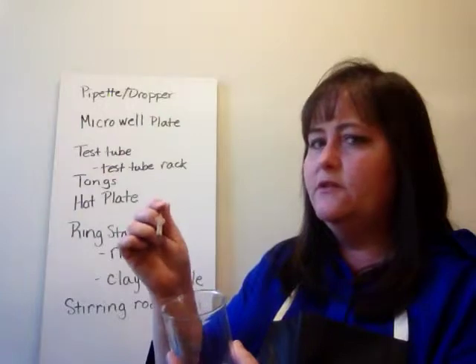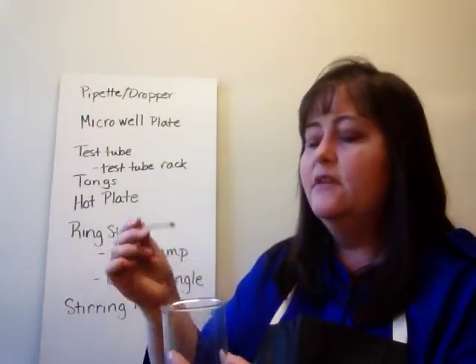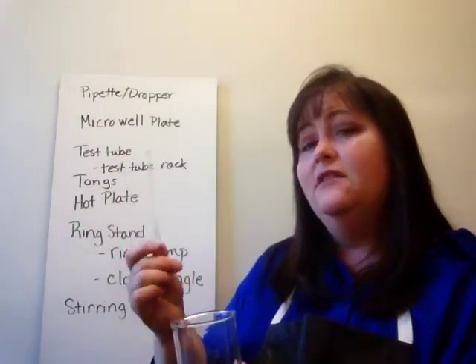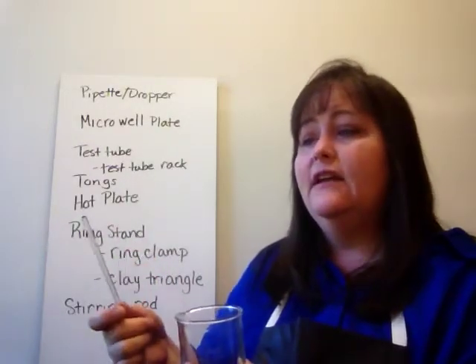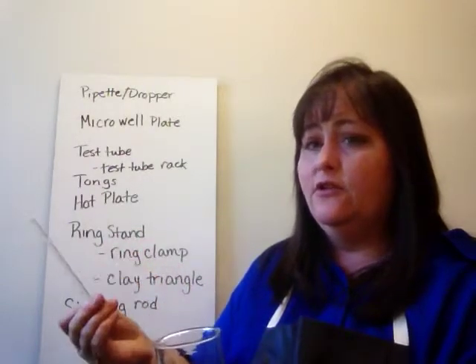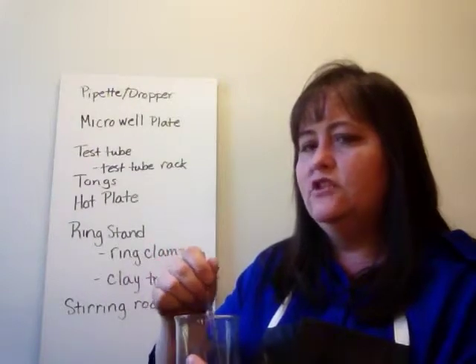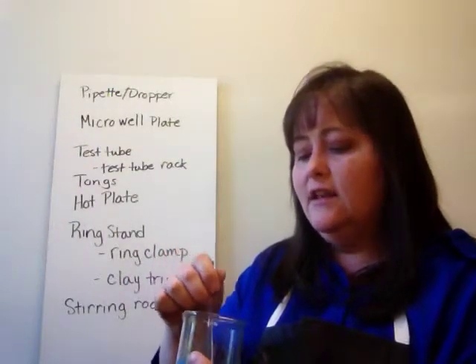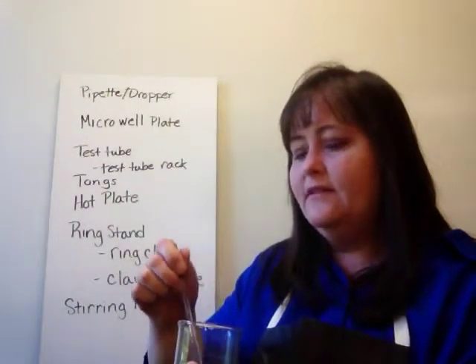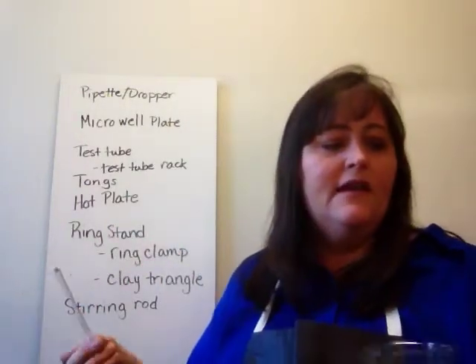Now you got to be careful with stirring with a stirring rod because you do not want to hit the sides. Because if you're hitting the sides and there's a weak spot in the glass, it could crack and cause problems. The glass would drop into your chemicals and it could cut you. So you want to make sure you're not smacking it against the side. You want to stir gently in the middle of the solution, not slamming it against the bottom, not slamming it against the sides. Always make sure you're careful with stirring rods.